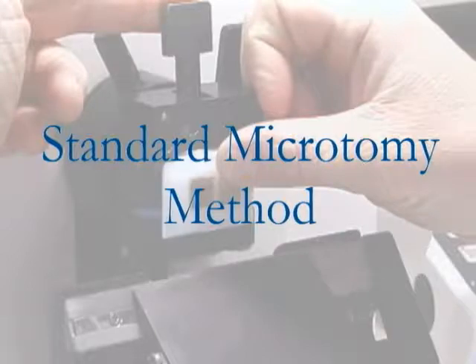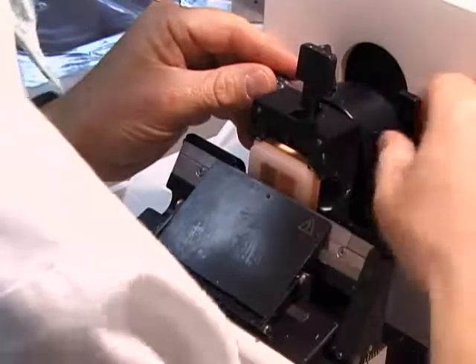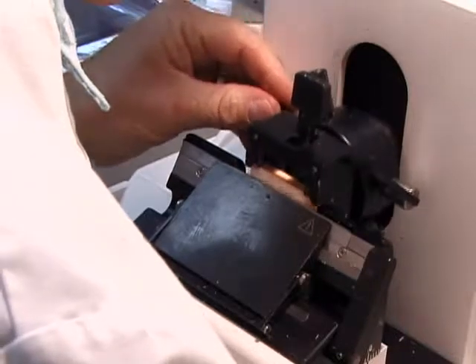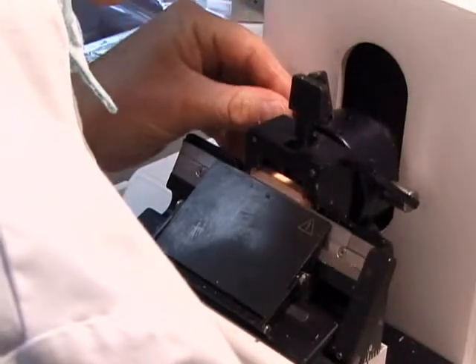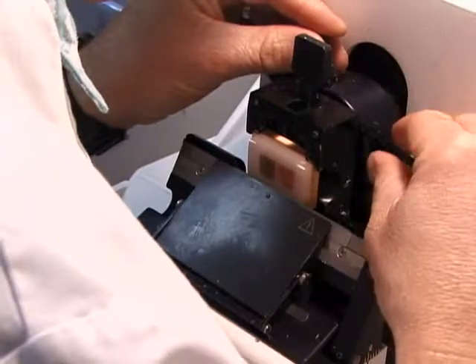If you are an experienced microtomy technician, you will want to section the array manually. There are many advantages to this technique. Depending on your microtomy experience, sections can be cleaner and crisper than the tape method. There are many factors that can hinder clean microtomy. The more punches in the array, the quality of processing and types of tissue involved all play a role in how easy an array is sectioned.